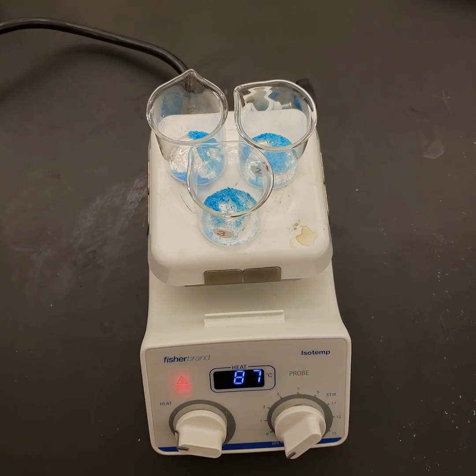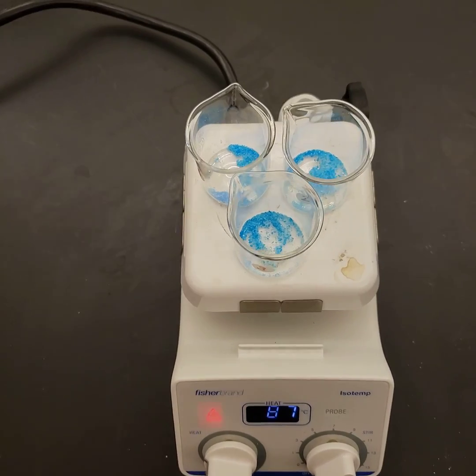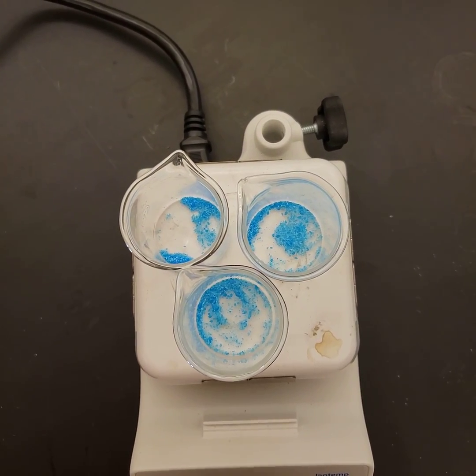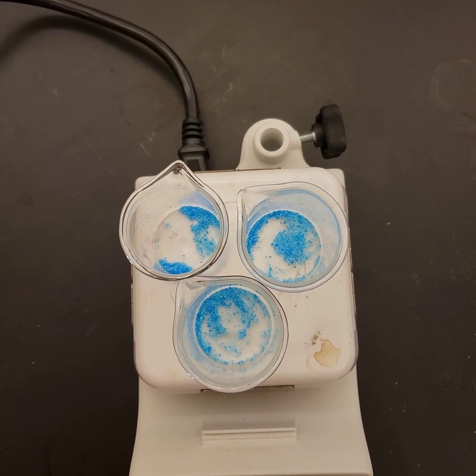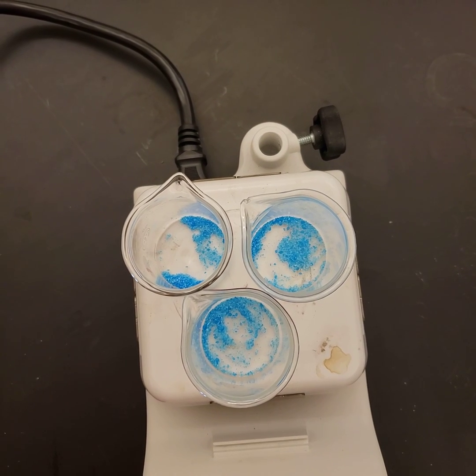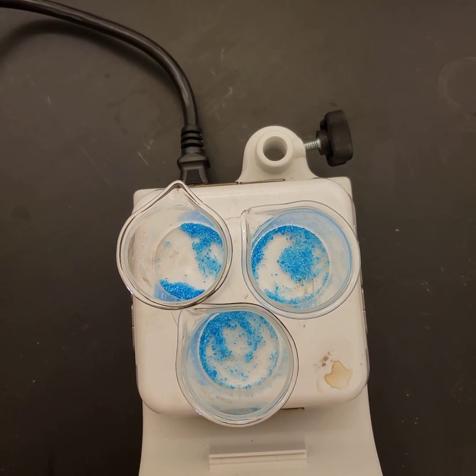For lab report 5, the hydrate of a salt, we have added small quantities of copper sulfate into these beakers. Copper sulfate, when it's complex with water, has a bright blue color — you can see it down in there.